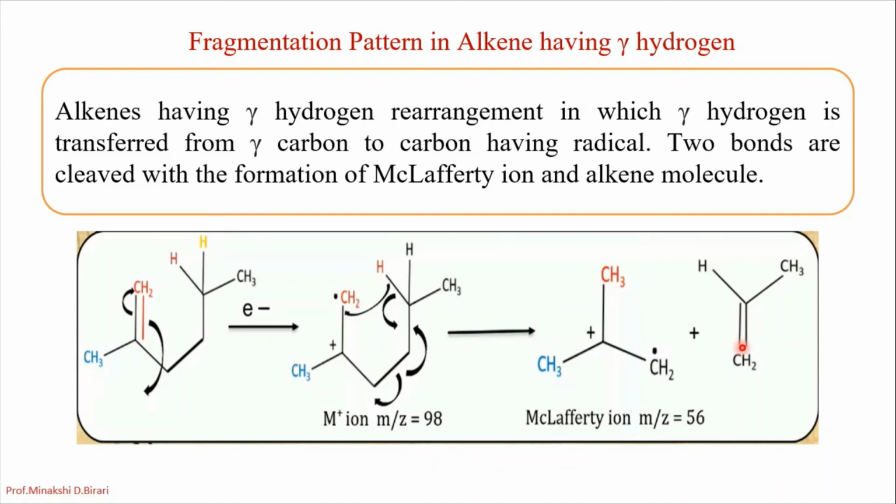The McLafferty ion shows the peak at mass to charge value 56. It will be observed in such alkenes having gamma hydrogen.